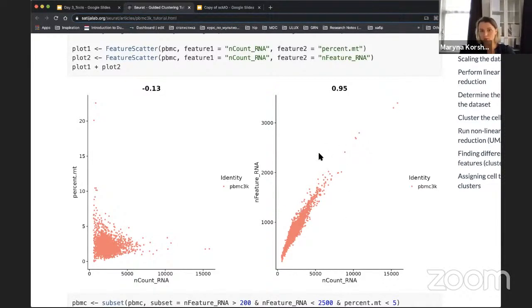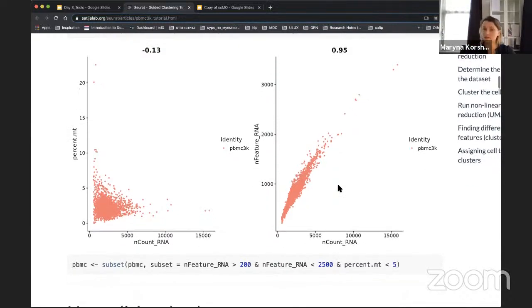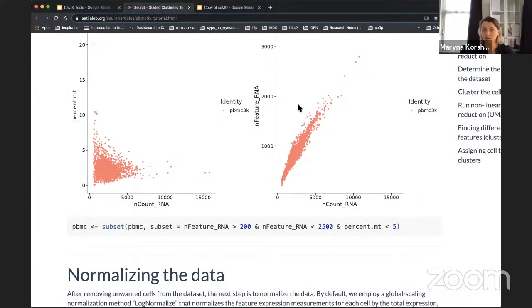That is why you use a visualization to make the cutoff and see where to actually set it. But it's better to set the cutoff not sharply here at the most dense point, but still including some extra data which also might be contamination.